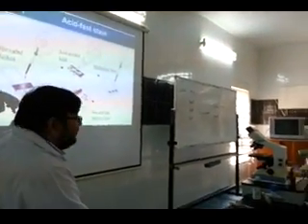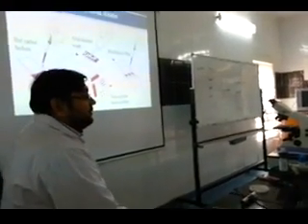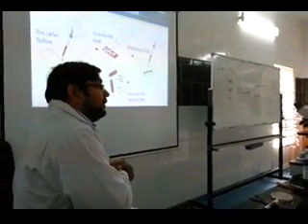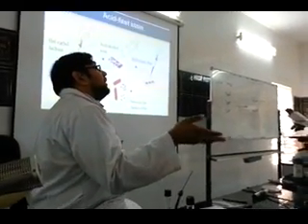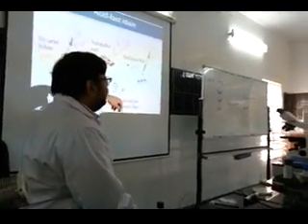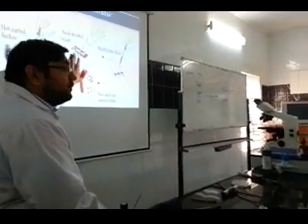Okay. Then what happens? We wash with acid alcohol, HCl. What happens? Non-acid-fast bacteria give out the color, but acid-fast, that is mycobacteria, keep the color. That is why the name is acid-fast. Even with acid, you cannot decolorize the bacteria. Then you put methylene blue, and the non-acid-fast bacteria, that is Gram-positive, Gram-negative bacteria, if they are there, will become blue. And acid-fast will become red.